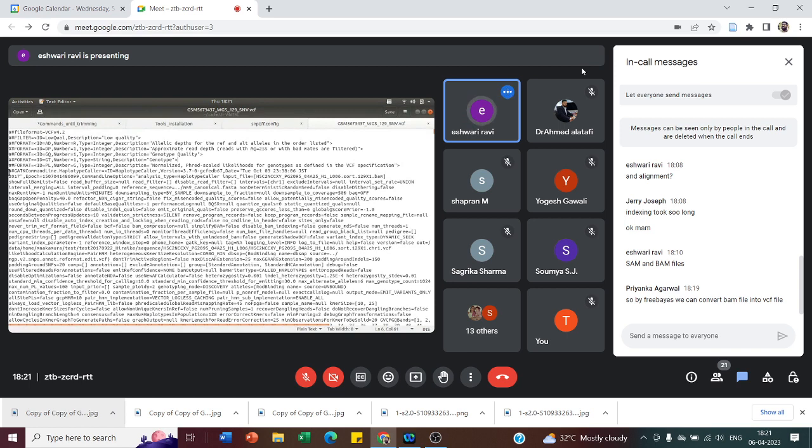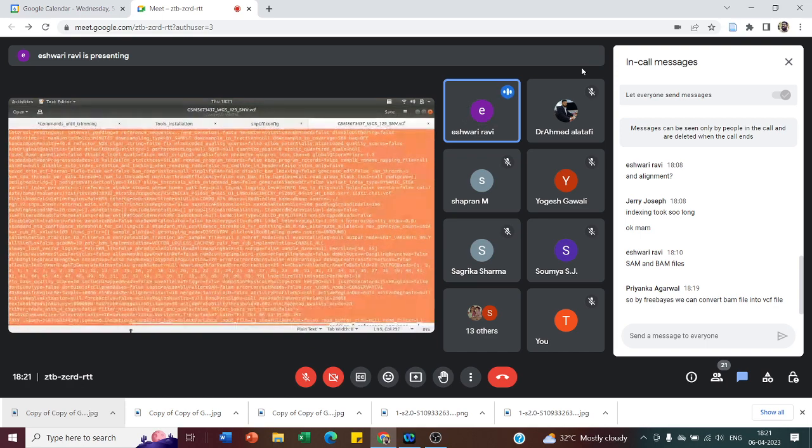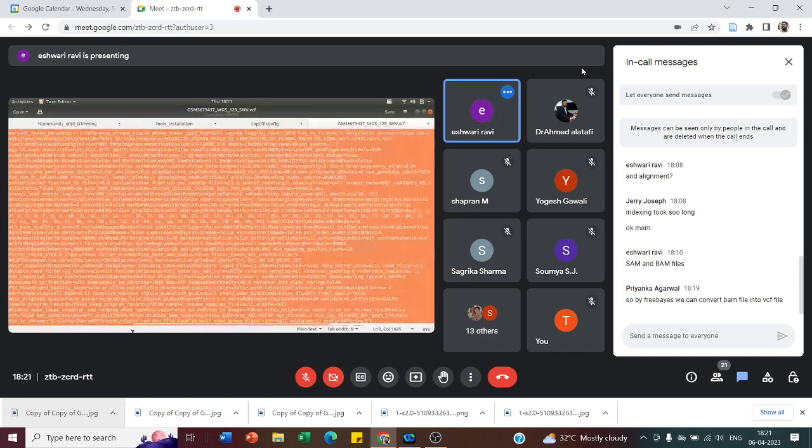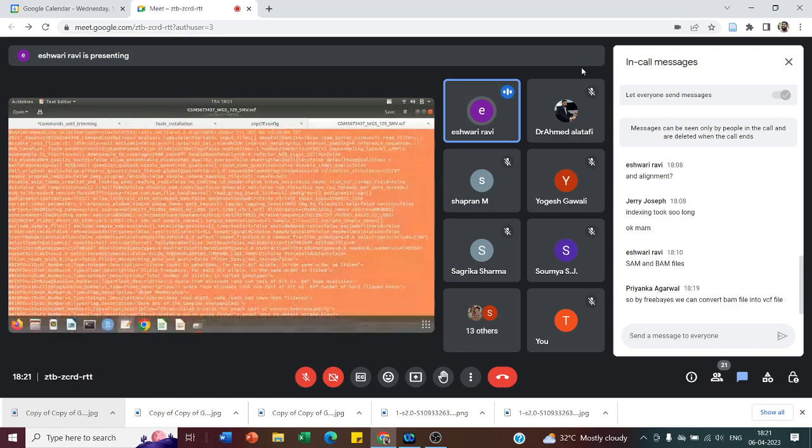These are all the header parts. If you want, you can read and understand them. It gives us all the options it has, and the descriptions for each of them.